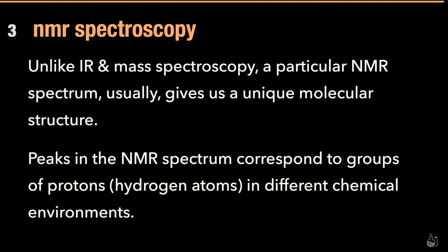Now, how do we do NMR? NMR is basically how the apparatus is set up, and all of that has been removed from the syllabus. So if anybody is looking at questions like how does the NMR work, what is spin, what is nucleus, all of that, nucleus spin, is out of the syllabus. What's left is how we can interpret the graph to come up with an organic molecule.